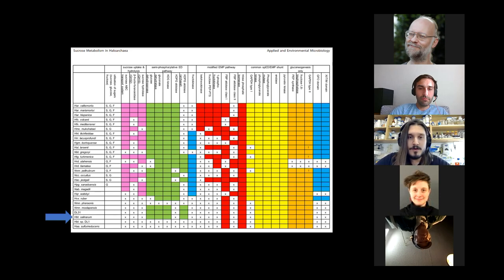So we were thinking, what if we take some of the genes from more sucrose-capable microbes, not sucrose tolerant, but ones who can metabolize sucrose effectively, and move those genes over, a little bit of metabolic engineering. It's about 6 or 7 genes, and actually get Halobacterium to eat sucrose, but not as a microbe, as a plasmid. So you can do selection with Halobacteria using sugar.